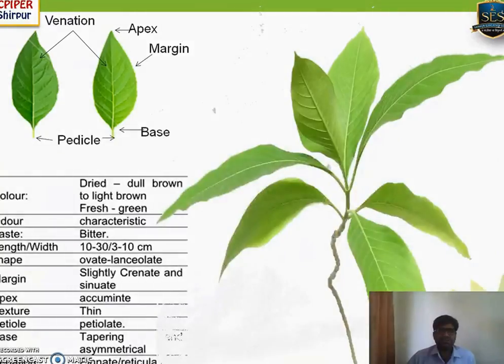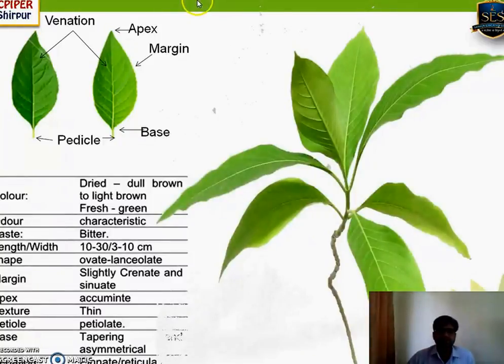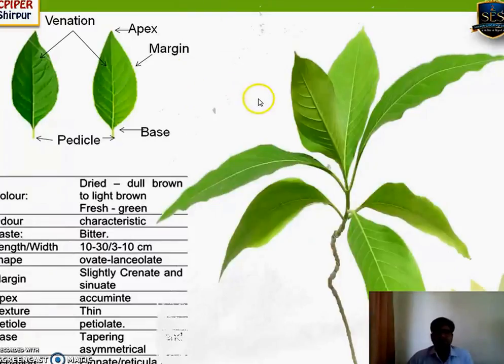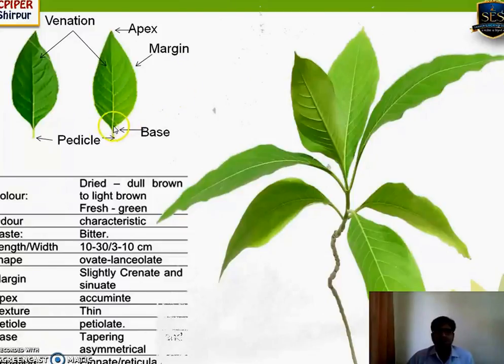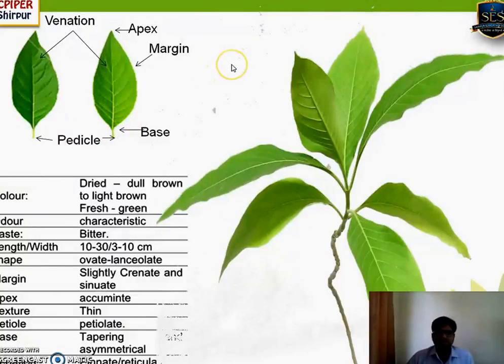In morphology we are going to see color, odor, taste, size, shape, and extra features. As the part of the plant changes, the extra feature changes too. Being a leaf, the extra features would be apex, base, margin, venation, and presence of petiole and node. Among morphological characteristics, three are subjective and three are objective characteristics.